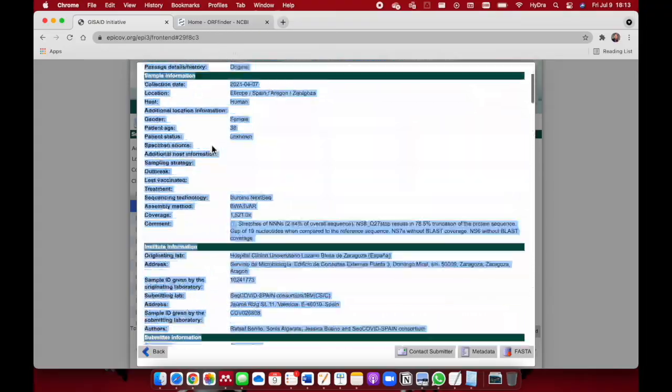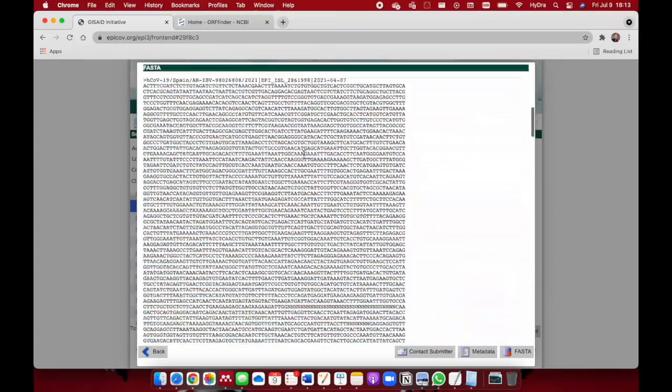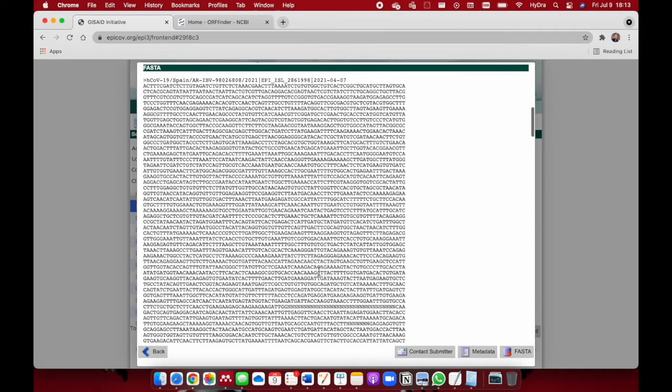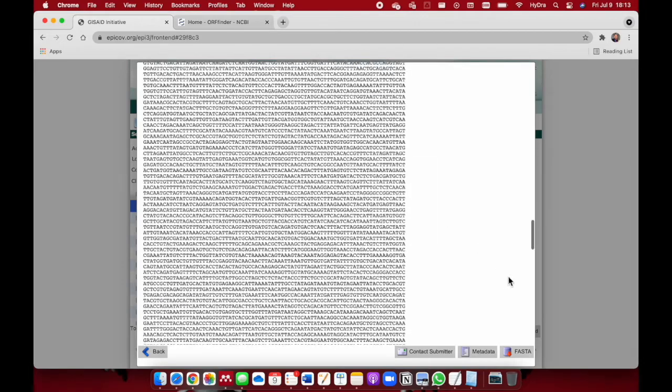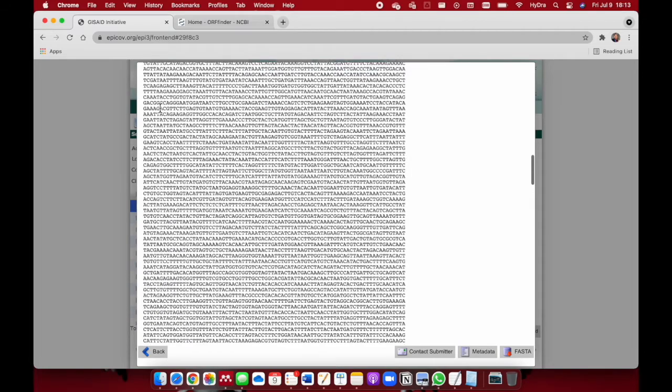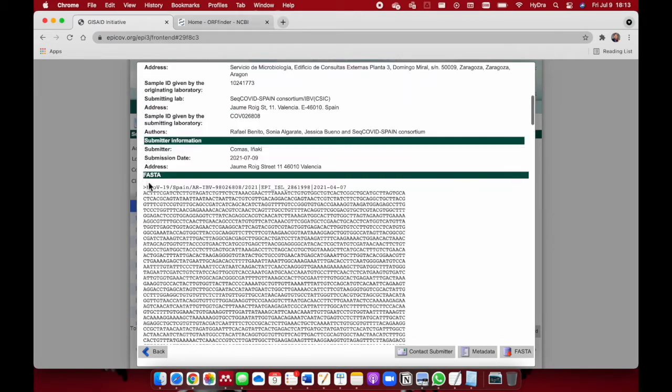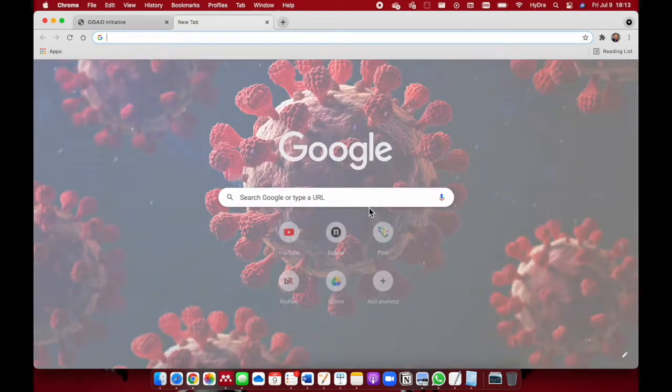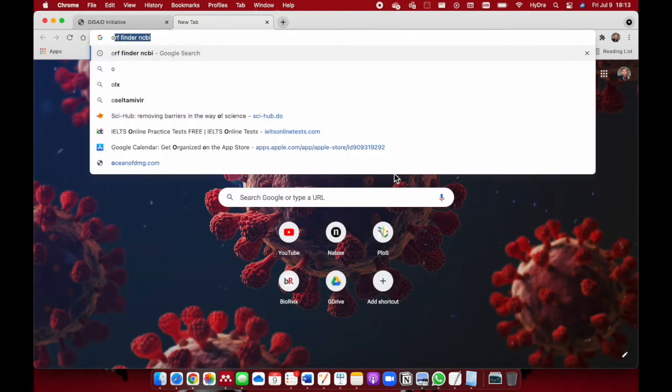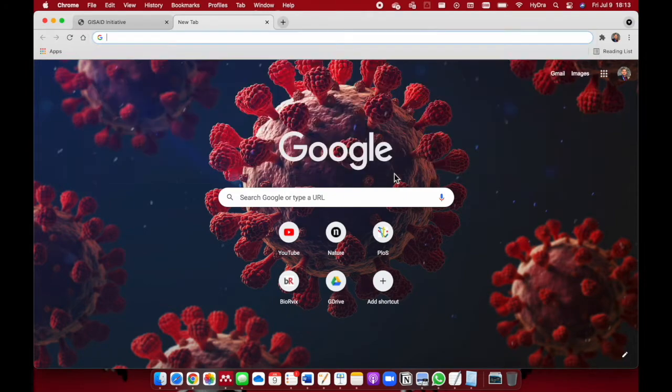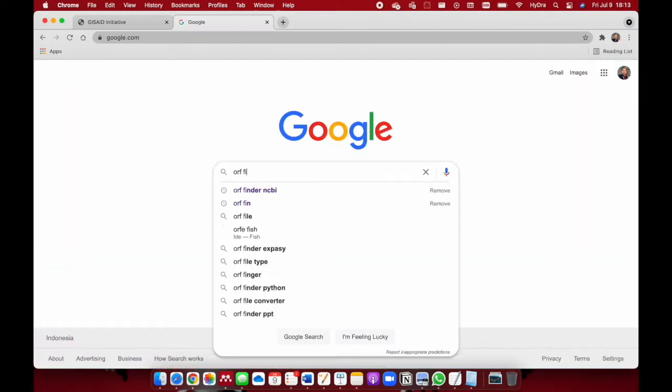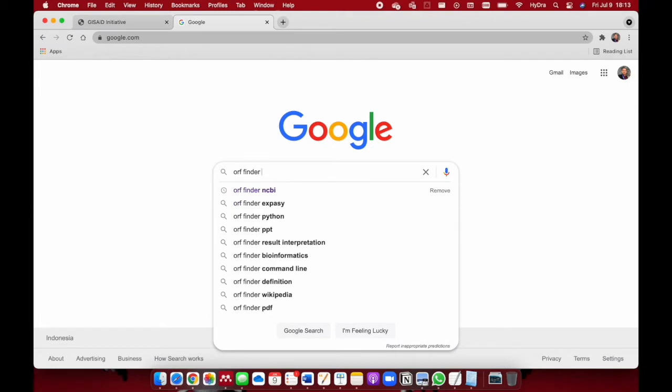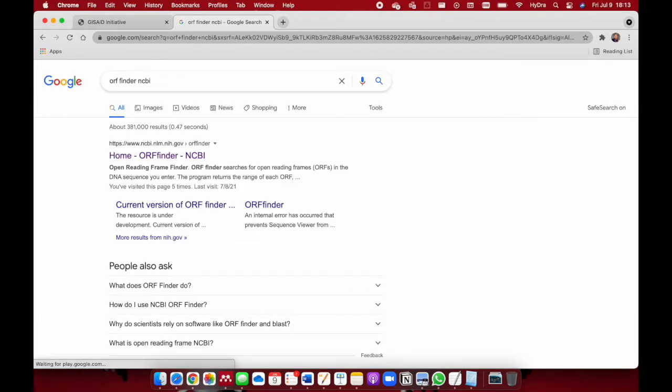What we need to do now is check what are the open reading frames on this whole genomic sequence. I'm going to copy directly from here instead of downloading. Let's open a new tab and go to Google and search for ORF finder NCBI. Click on that.